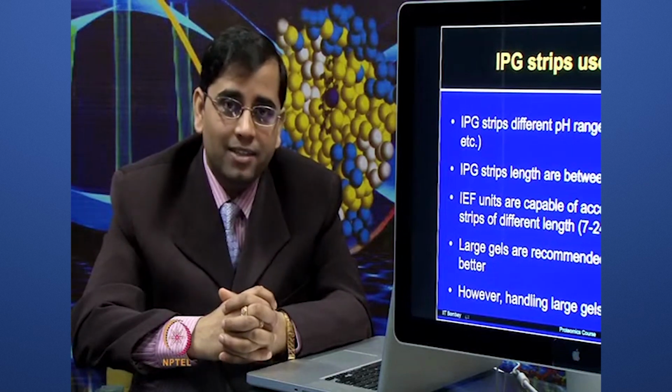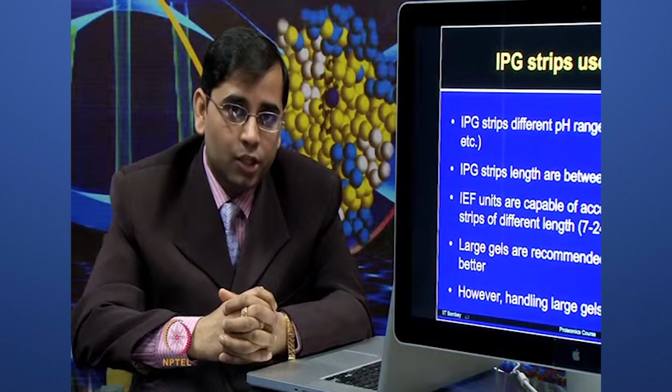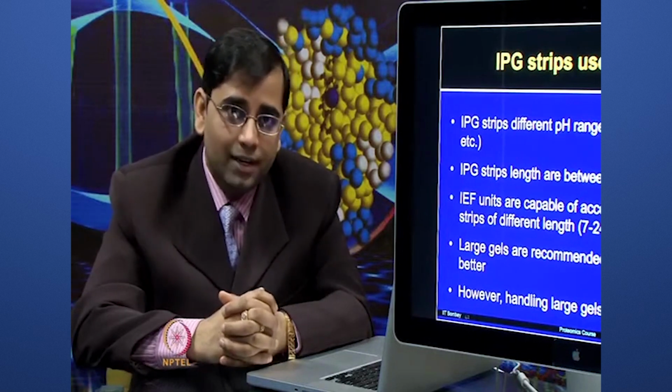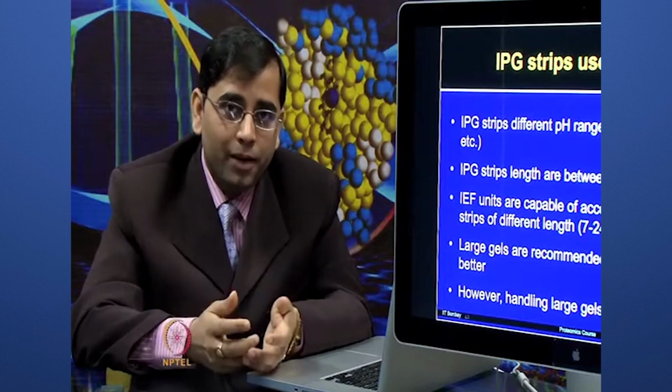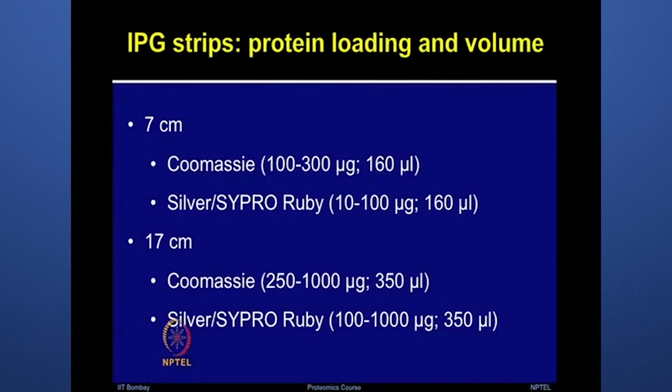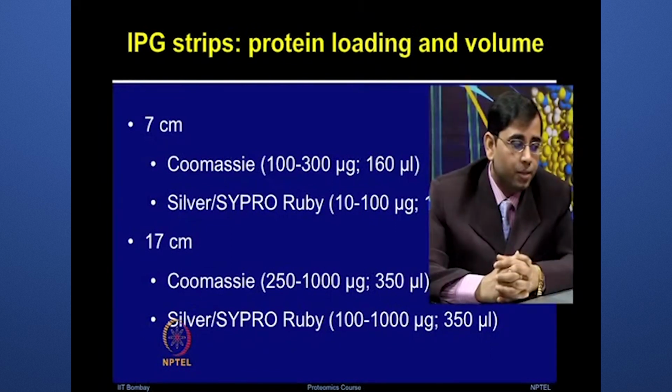But handling the large gel is very tedious. So I'll show you some lab demonstration, the video for that, so that you can be well prepared to perform these experiments in your lab. These are some recommendations for how much protein one should load on the IPG strips.